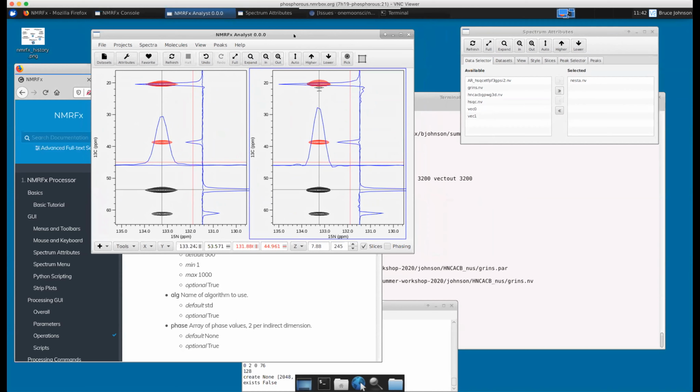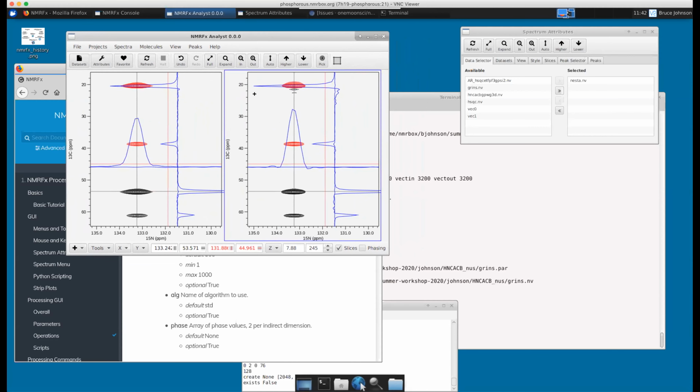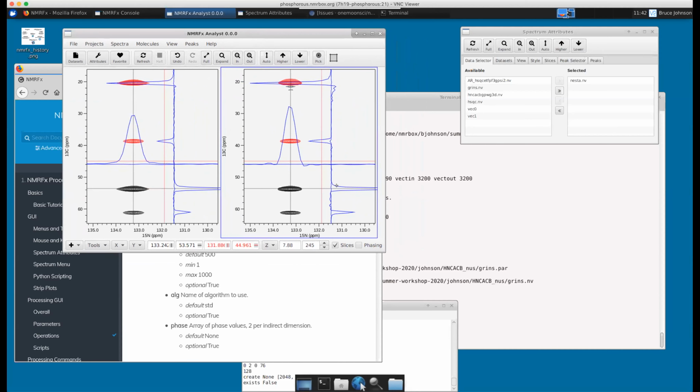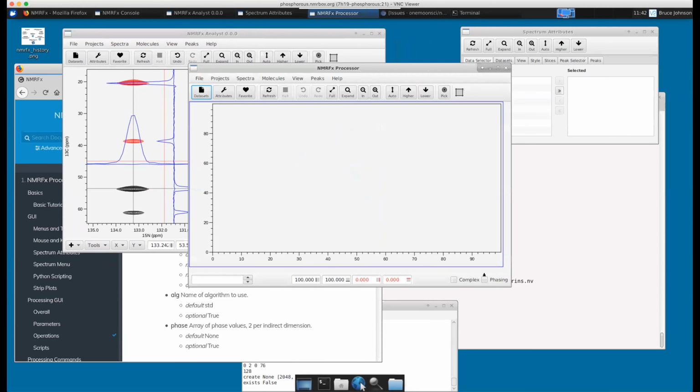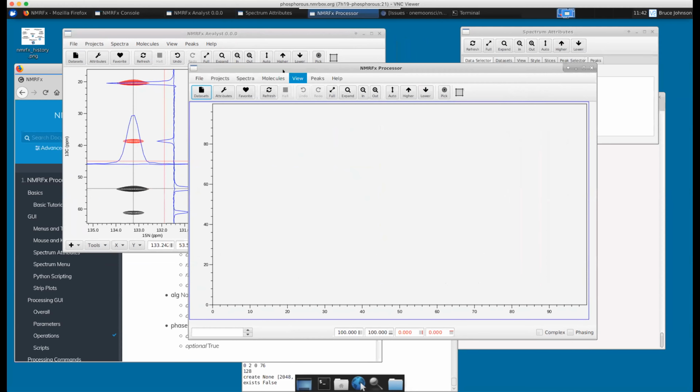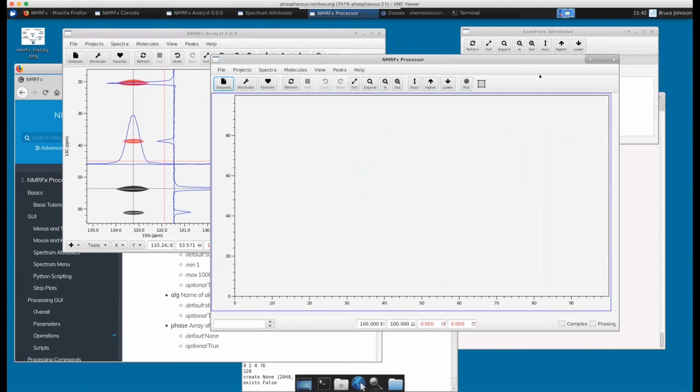Normally these windows are resizable, but if you open up some dialogues or file choosers, once you've opened them up, it makes the window not resizable. And I'm trying to find all the places, as workarounds to get that. Apparently there's one that I haven't got. I will say you can always open up a new window, File, New Window, and that new window is resizable, and I could go copy and paste Spectra into it.